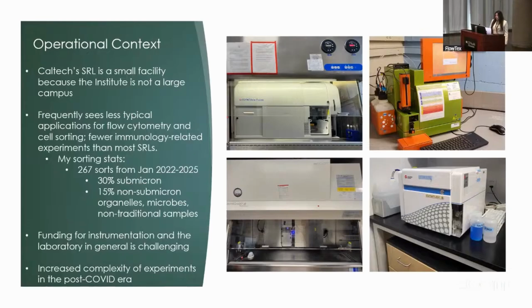There are multiple operators in the facility, just like any other facility. But I've shared just my sorting stats from, again, the post-COVID era, just to highlight what sets the facility apart in terms of the experiments that come into us. I personally handled all of the submicron sorting and microbial sorting. So in total, 45% of my sorting is non-traditional applications.